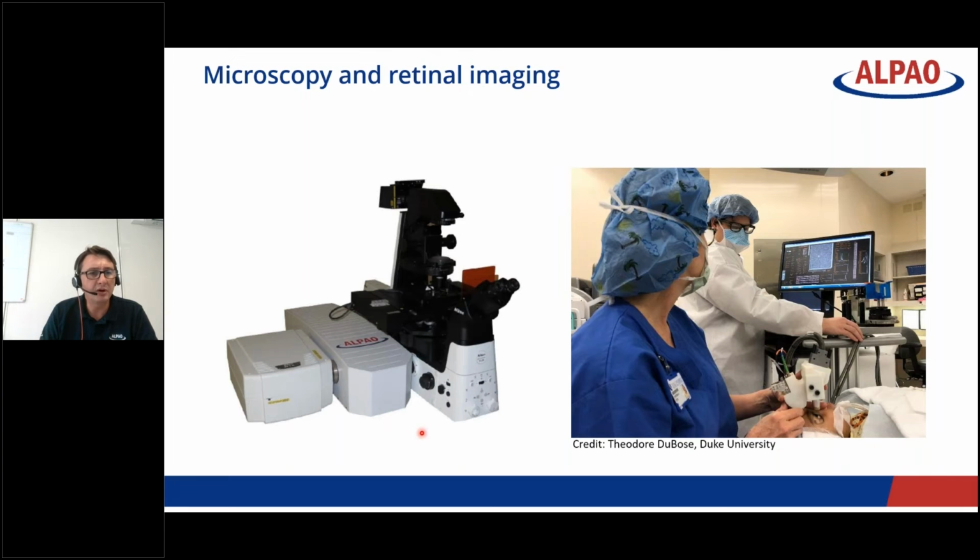So you have a lot of modules that can be plugged onto your microscope. So this is why in this kind of application, probably the good way is to have all the AO system in a box that you put in between the microscope and the sensor. In this case, I think it's a spectrometer or an OCT system.